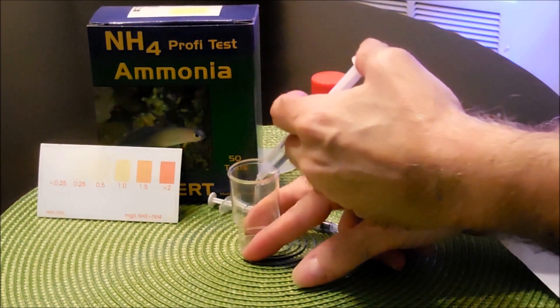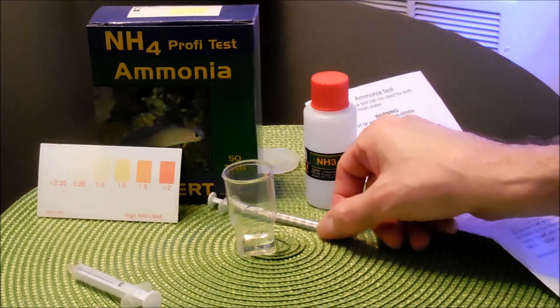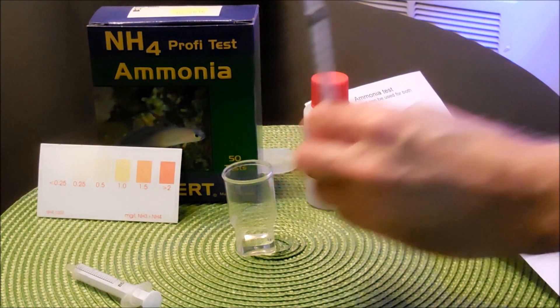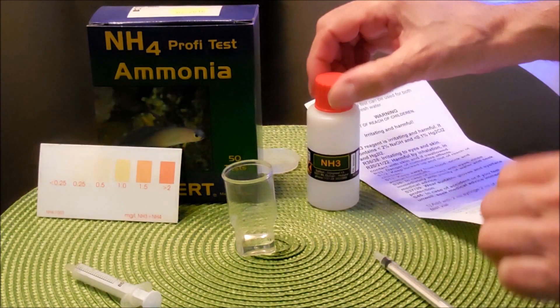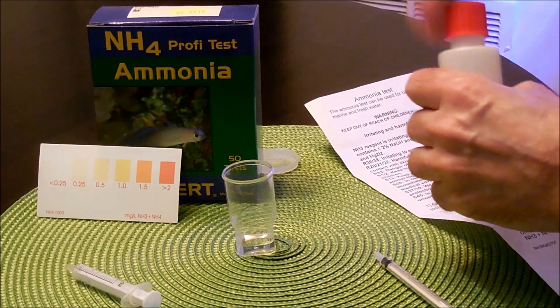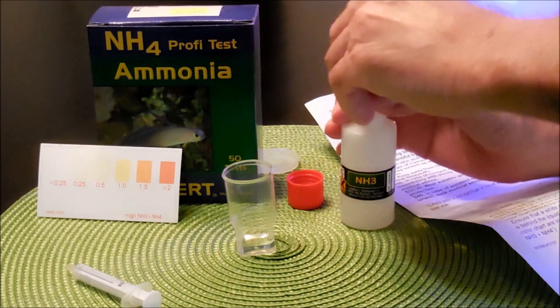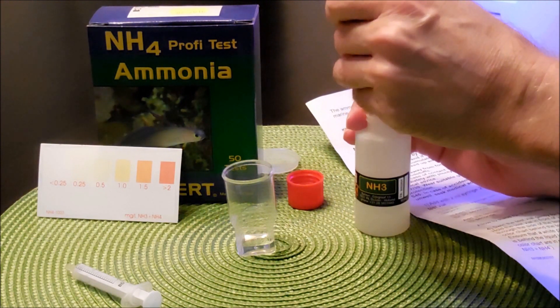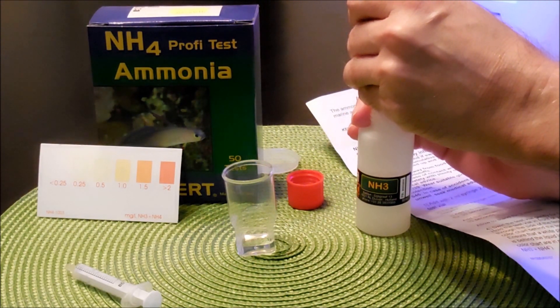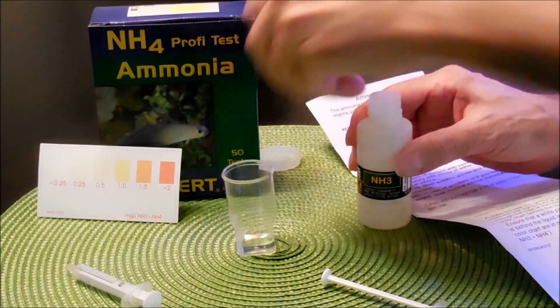Then it says fill the 1 mL syringe, which is this one here, with 1 mL of the NH3 reagent, which is just here. So we're going to go ahead and do that. There we are. Let's close this.